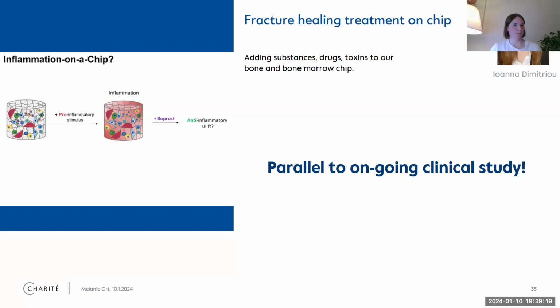And if you then remember how it worked with the metal on our chip, Annie would just go back and forth between the clinics. So it's basically like, is this what it looks like in patients? And then they say yes or no. So she goes back to the lab, and sometimes we find things, and then we ask clinicians, have you seen this before?